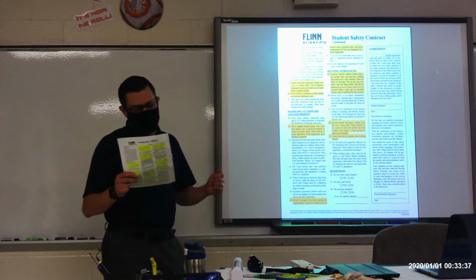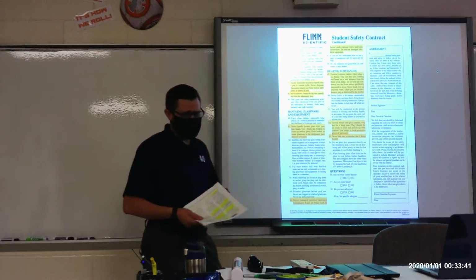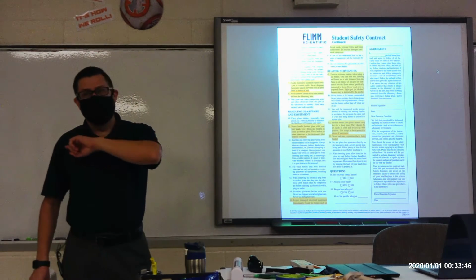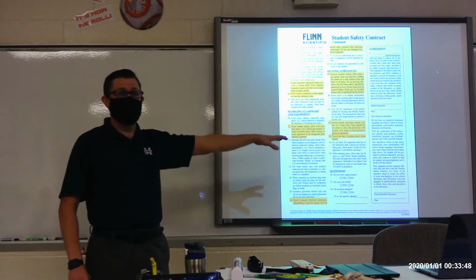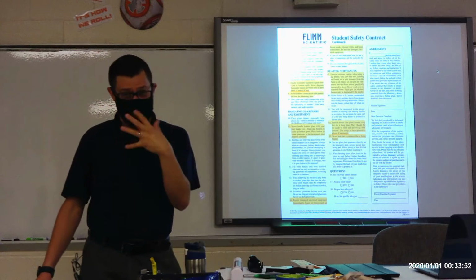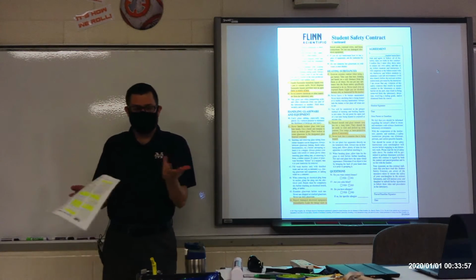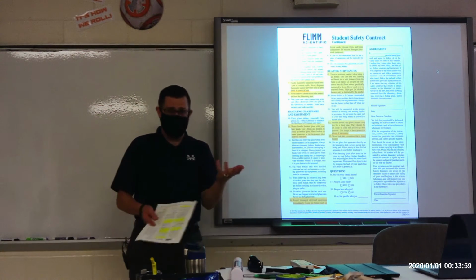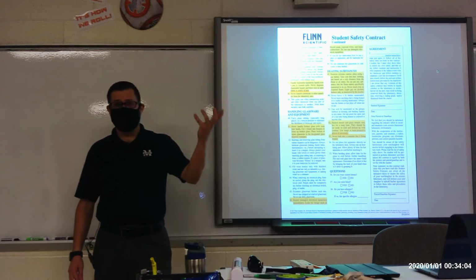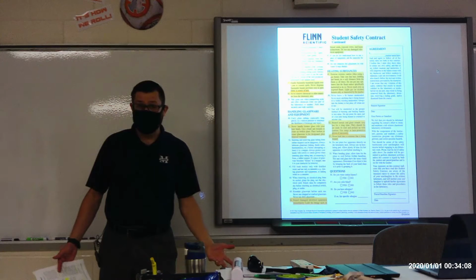Okay. Number 38, never remove chemicals or other materials from the lab area. Again, not too many chemicals in here, but you don't want to just take things from a lab. And I don't know why this was a fascination at some points, but I've had students try to take parts of dissection specimens out of the classroom with them. I had one student that took the stomach out of a frog and stuck it in his pocket. Like, why would you want that in your pocket, first of all?